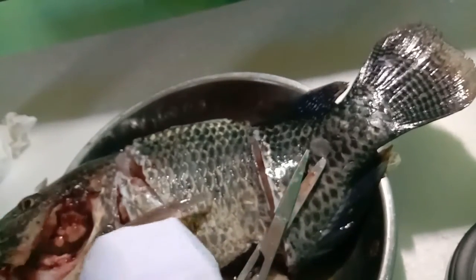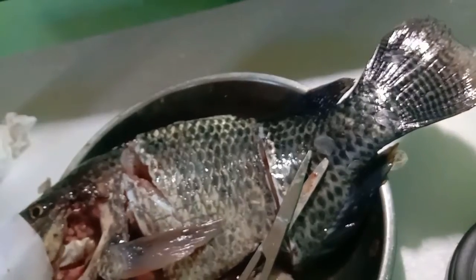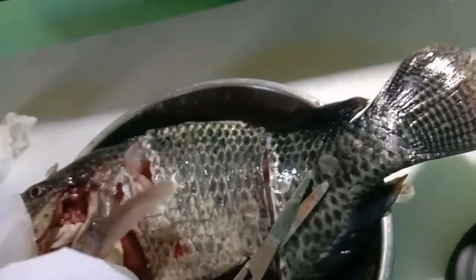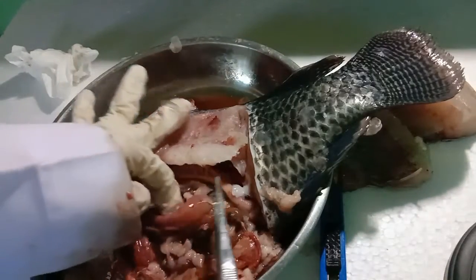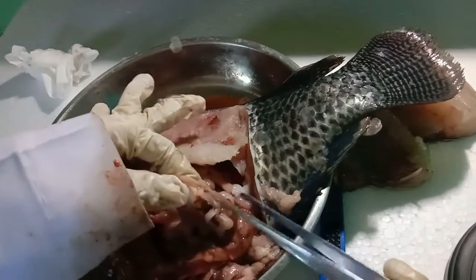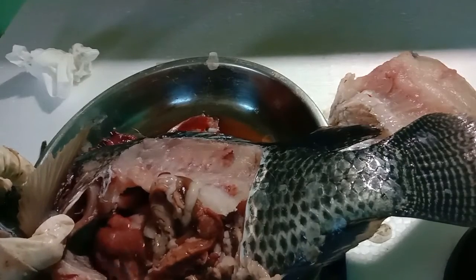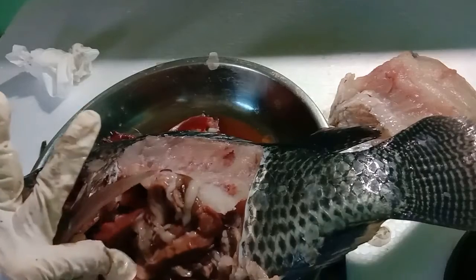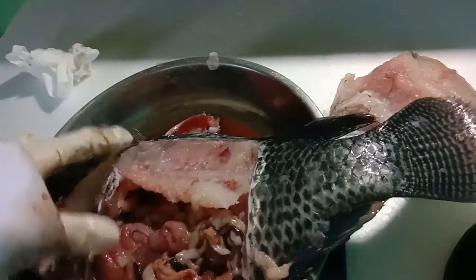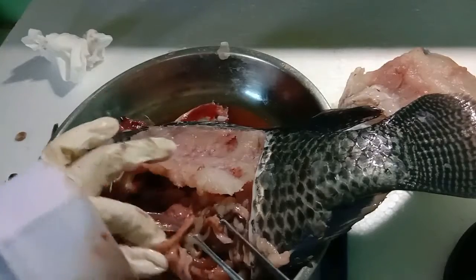not really clearly. But here, this is the stomach. This is the stomach. Here, this white is intestine. This is the liver. I guess this is the pyloric caeca. It's near the intestine.